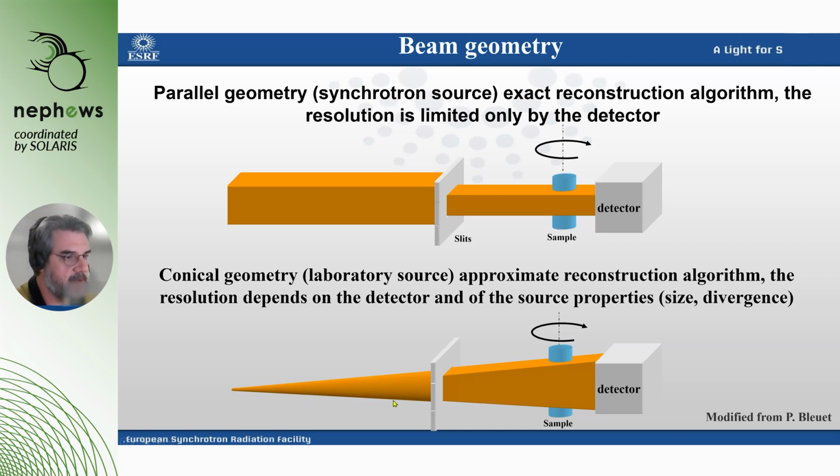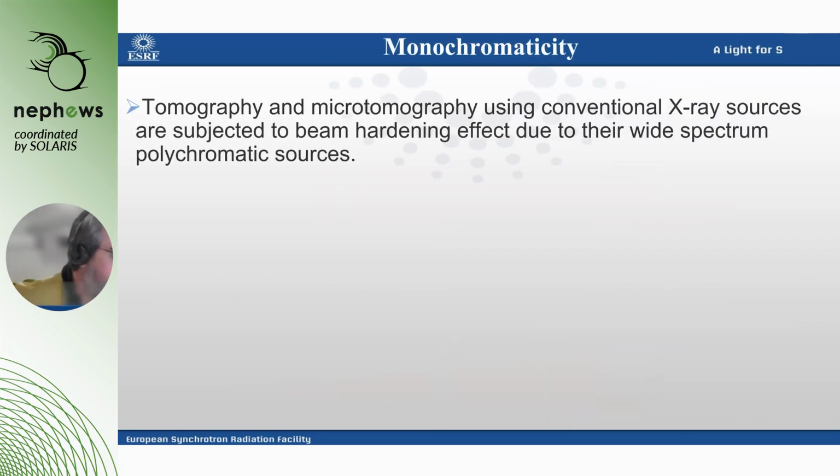In addition, it is possible to make conical geometry tomography with a synchrotron beam, typically by using nano-focusing, and it is the base of nanotomography, but I will not present this technique today. I will stay only with microtomography.